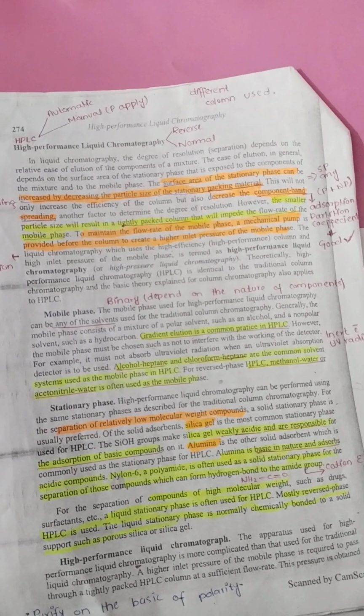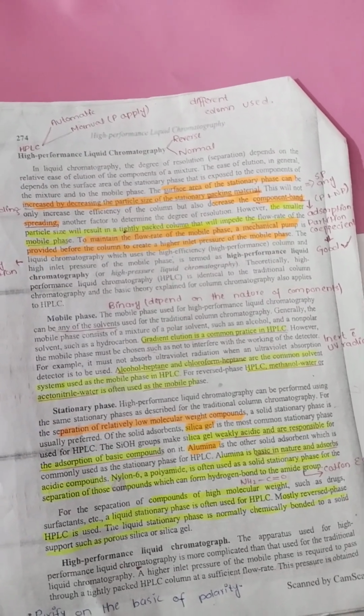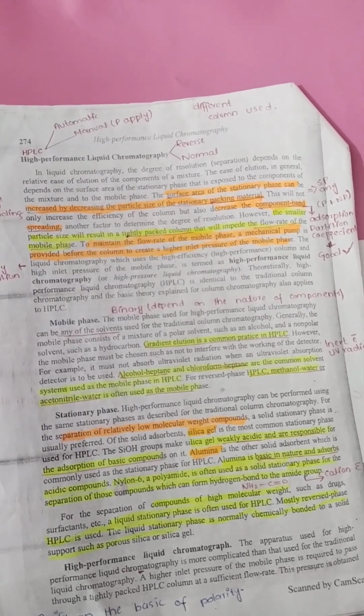Due to the good result showing in our detector, we use a small particle size of our stationary phase.